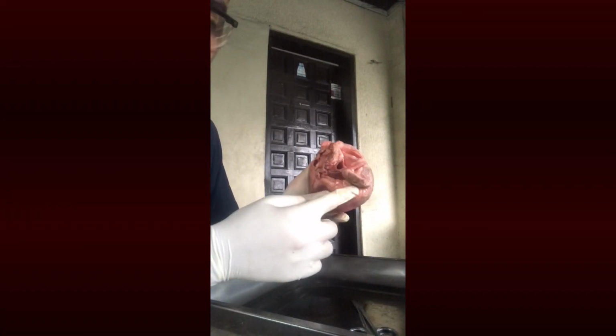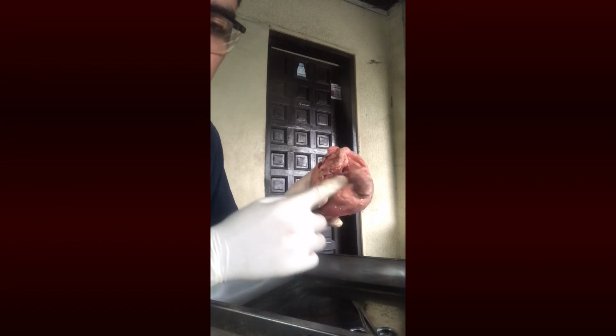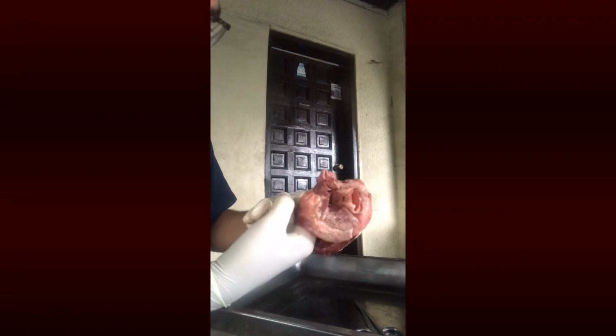Locate the right atrium. Notice the thinner muscular wall of this receiving chamber. Find where the inferior and superior vena cava enter this chamber. And notice the lack of valves.